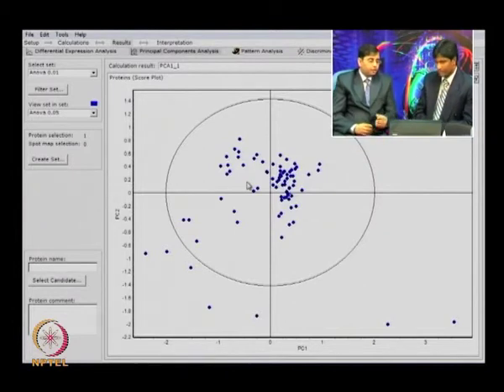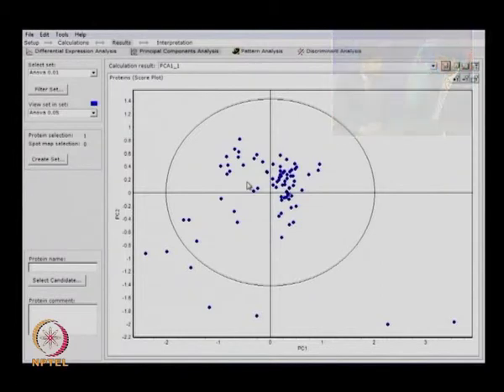So this is a powerful statistical parameter. By using it, you can identify some outliers, which could be the potential discriminator between the control and treatment. Once you identify those proteins, you can go back to your original data from the BVA and get all the analysis done. Exactly. Oh, this is very interesting.